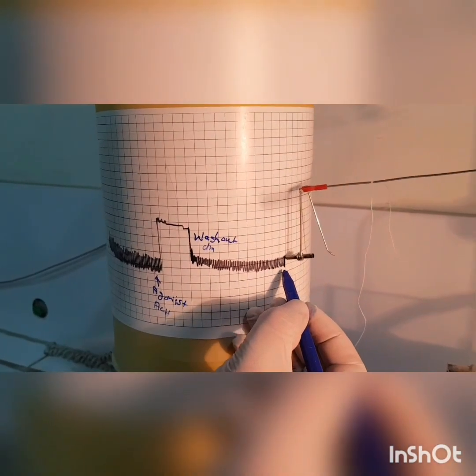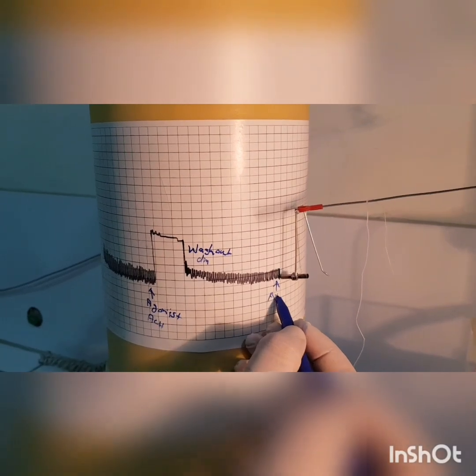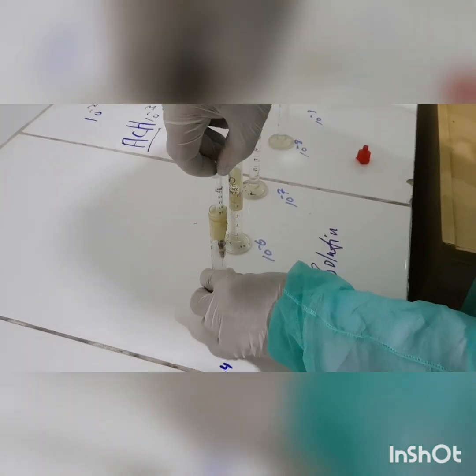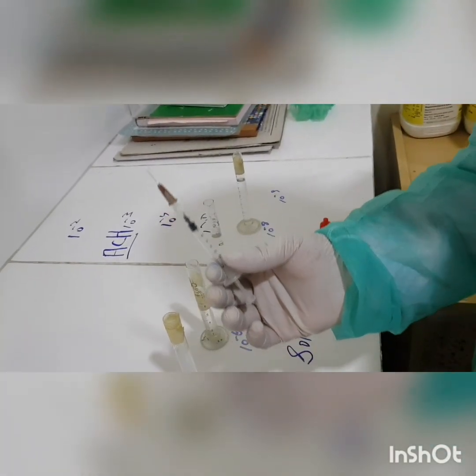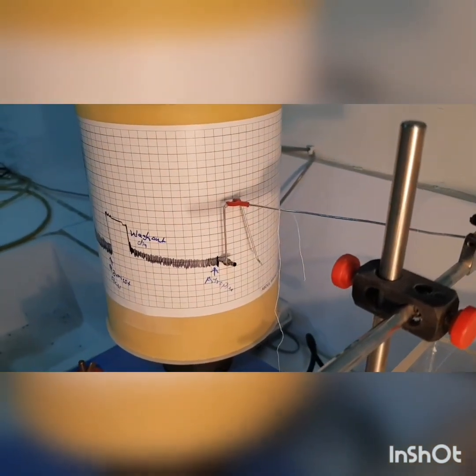Then again normal contraction. Here we will give the antagonist, which is atropine. Now we are taking 0.4 ml of atropine. Now we are giving the antagonist atropine in the organ bath.